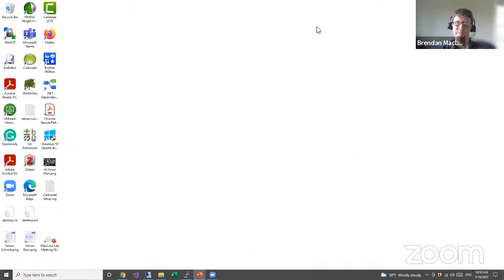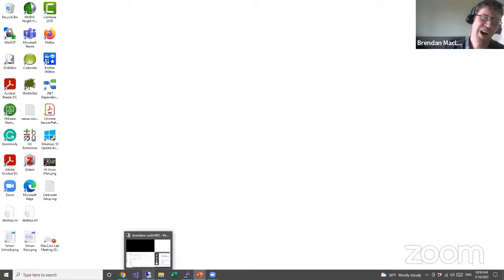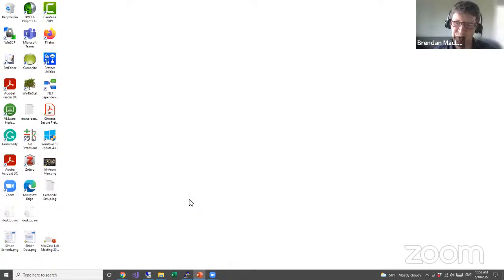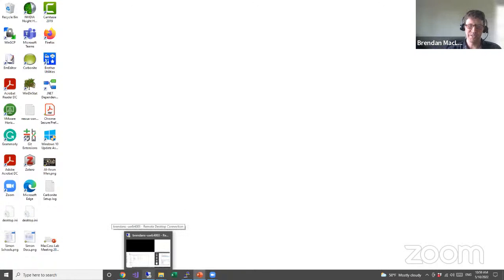So now we're going to go to how to use it, so that's Skyline Batch. There are the batch scripts that I created, and Skyline Batch should give anybody who can use the UI the ability to reproduce what I do with my batch scripts. They have been used to great effect on these other studies.